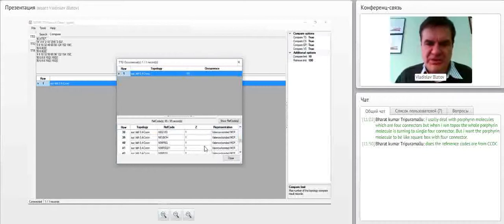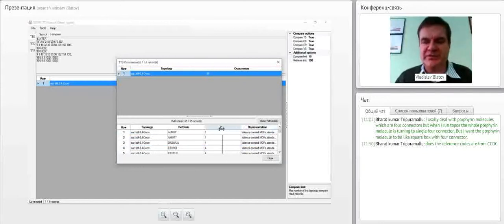Okay. All of them, by the way, are valence bonded. Let's look at this last column. Standard cluster representation. This means that here we used the standard method for cluster representation as we did it before. And I bet that almost all of them, many of them at least, contain dimers as our structure.